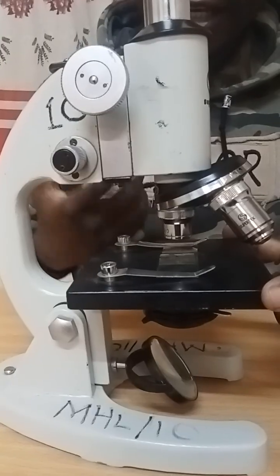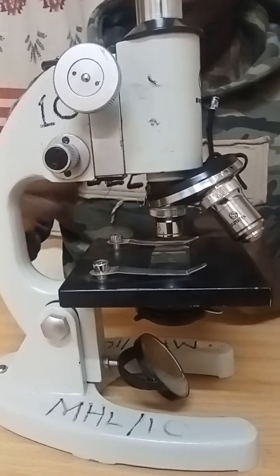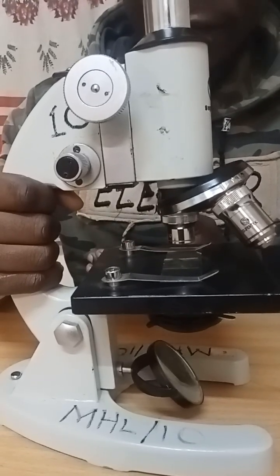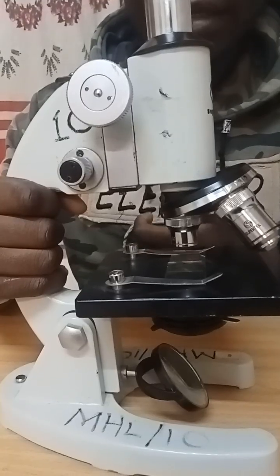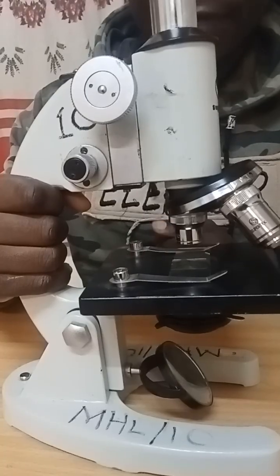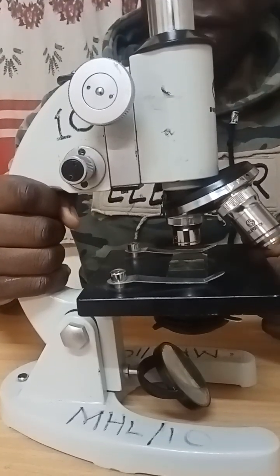We need to use a special device called a microscope, simply because the hand lens cannot see the cells in our body or in living organisms. Therefore, we use a microscope which has a higher magnification power to be able to see these cells which make up the living organisms. And we have two types of microscope. We have the light microscope and the electron microscope.